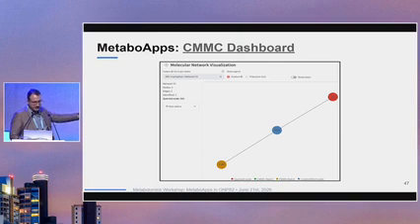So you're going to see the specific network for this feature on the CMMC dashboard. So you don't need to scroll over the whole network of your job if you don't want to. You can look directly for the ones that have either the feature ID or the precursor MZ that you're looking for.